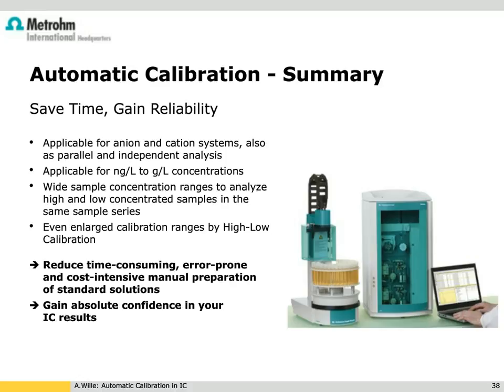But if you were specifically targeting carbohydrates, for example, then you might want to look at pulsed amperometric detection. With respect to mass spec, generally I would say probably electrospray ionization mass spec. But again, it depends on what you're targeting. So it's very application specific? Yes. If you're targeting one area, you make that choice. But if you're looking at a range of analytes, then you might want to go with something that can look for several different things.